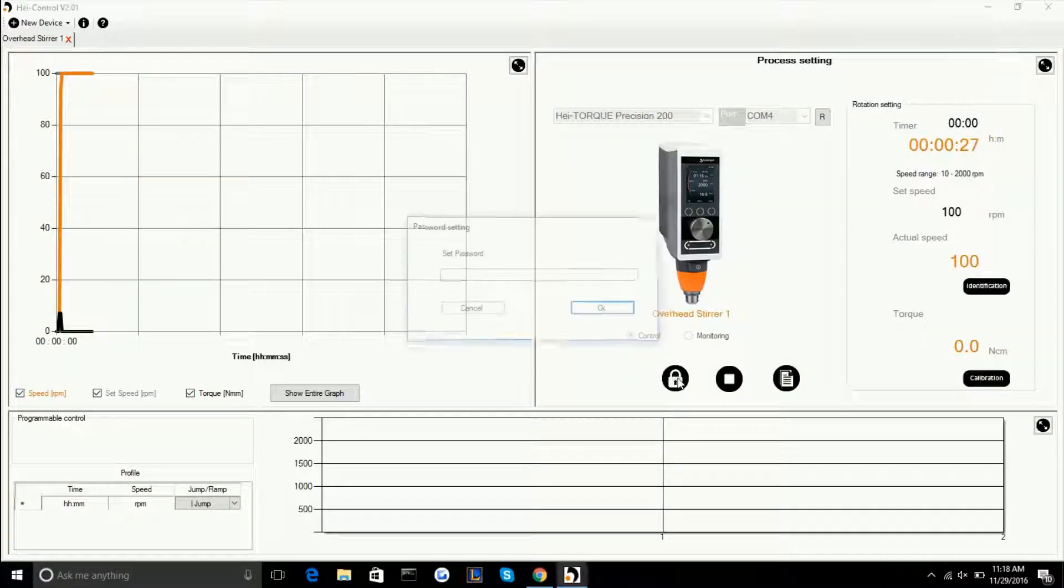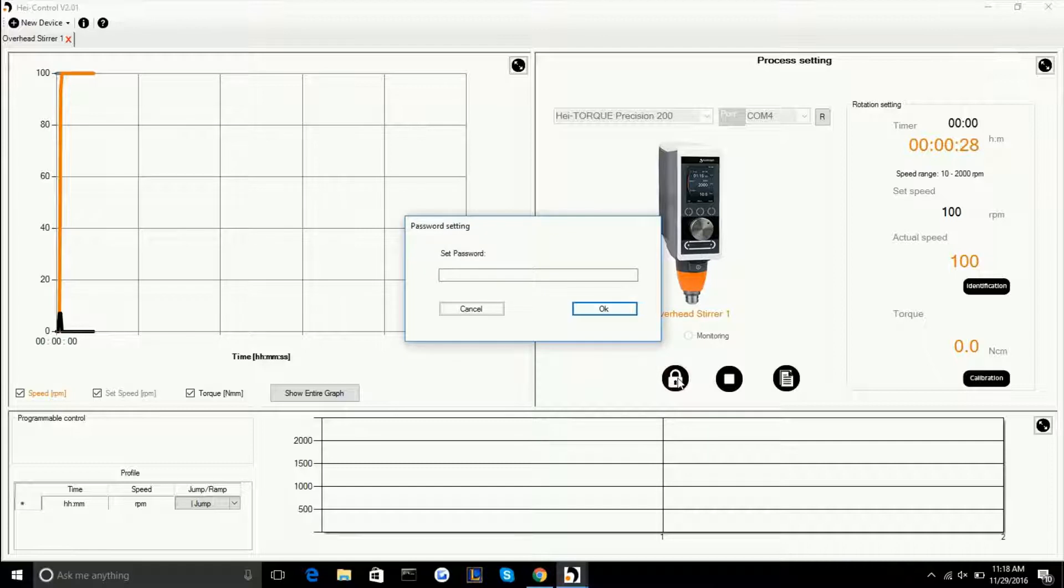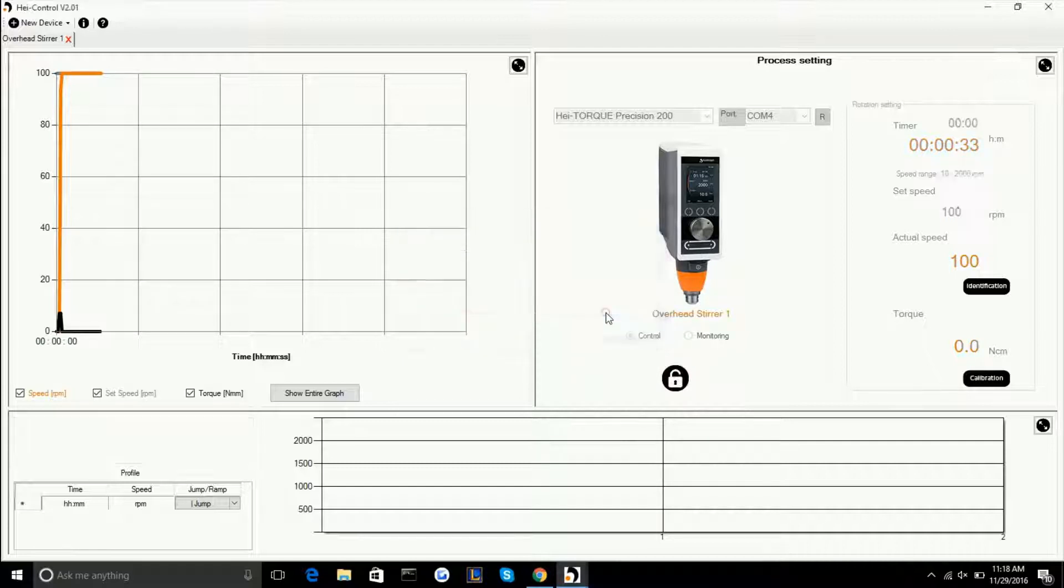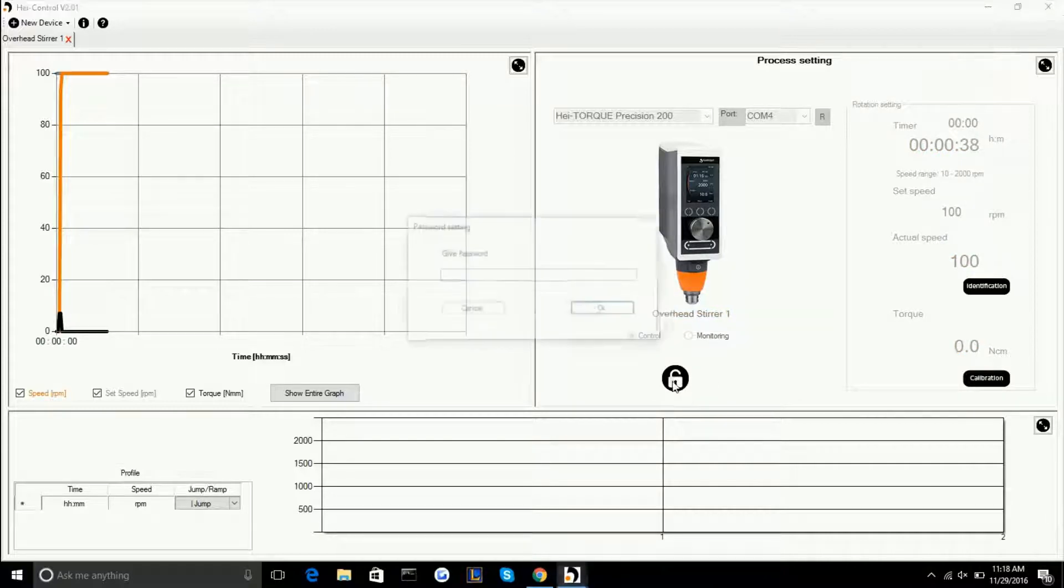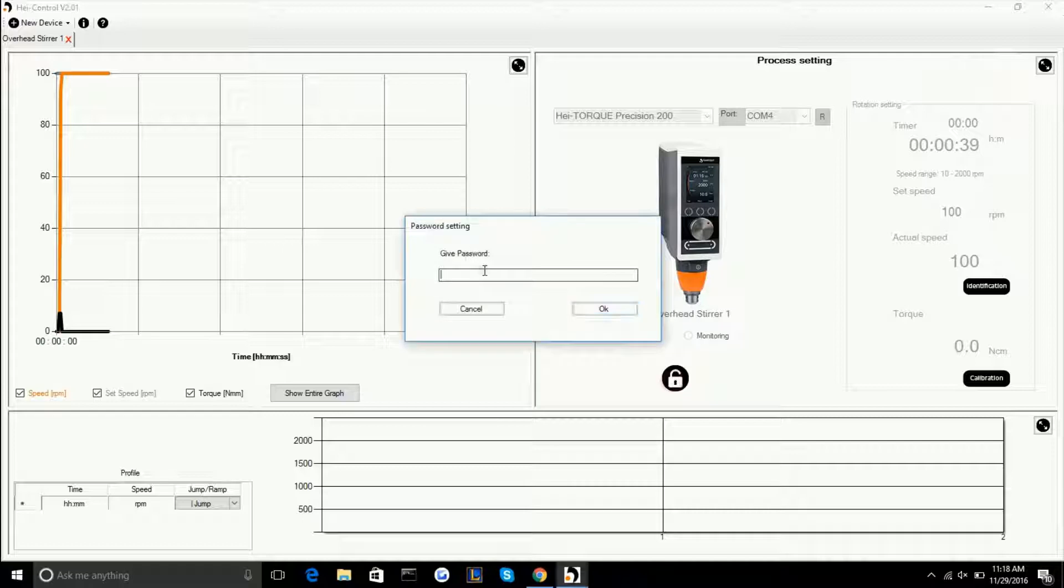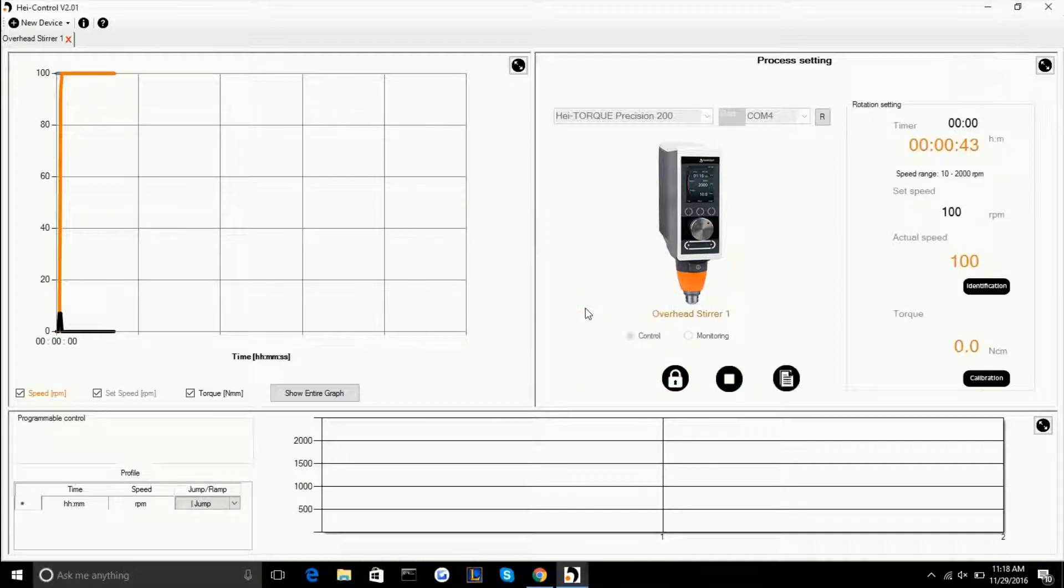There's also a feature that lets you lock the parameters to make sure that it doesn't accidentally get changed while you're away from the computer or while you're working on other things on the same computer. To utilize that you would push the lock, type in a password, and then when you want to unlock the parameters you just type in that same password over again.